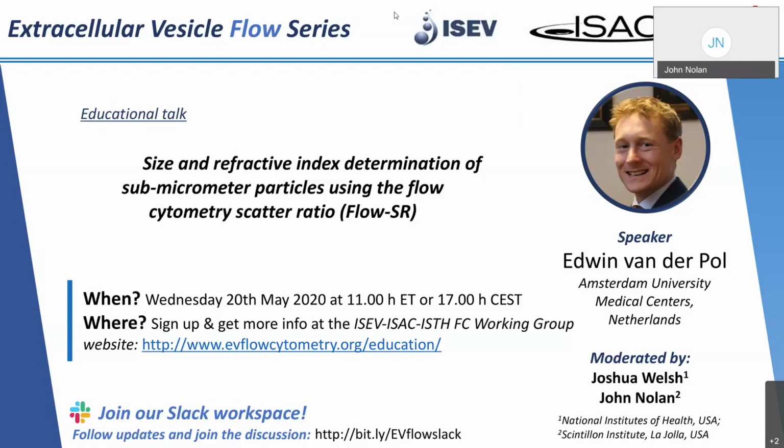One of the areas where he's really made some contributions is in the area of light scatter of EVs. Light scatter is an often misused and abused parameter, mostly owing to the fact that it's more complicated than people initially realize. But Edwin, along with my co-host here, Josh, have done really nice work showing how one can effectively use and interpret light scatter data from EVs. And so today, Edwin's going to tell us about some of his recent work in that area. Edwin.